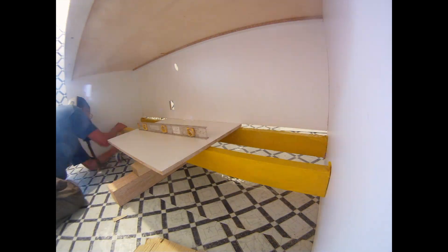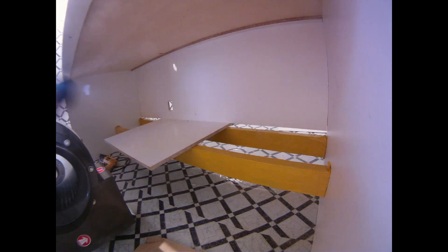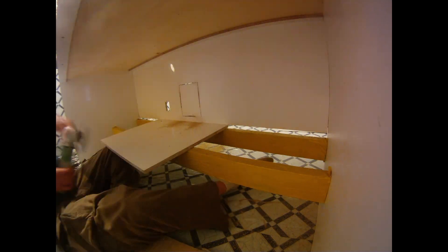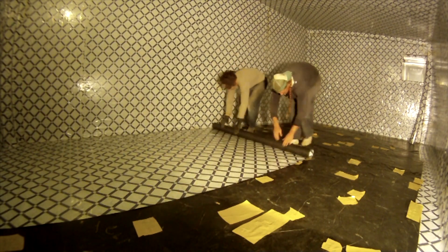Ironically, I did not want to build a laminar flow hood. I had so much going on building my lab, I just didn't want to build one. So I wound up buying one, but the one I bought had been used in a lab and it turned out it just was not good — it was basically set up differently than it should have been.